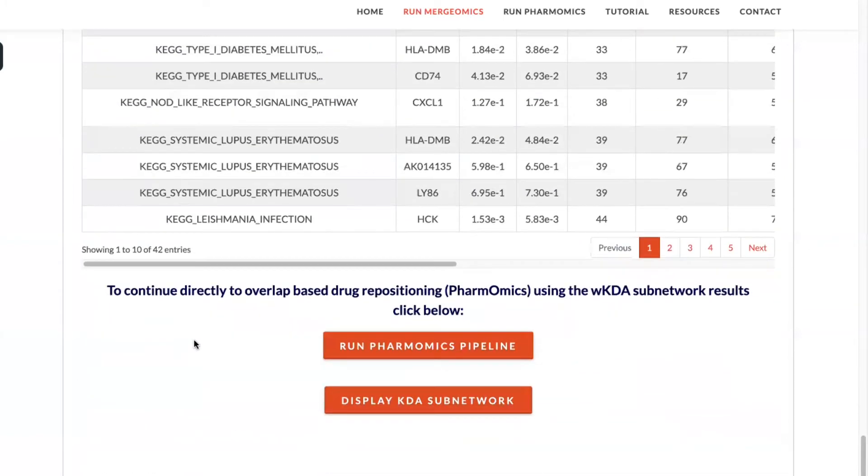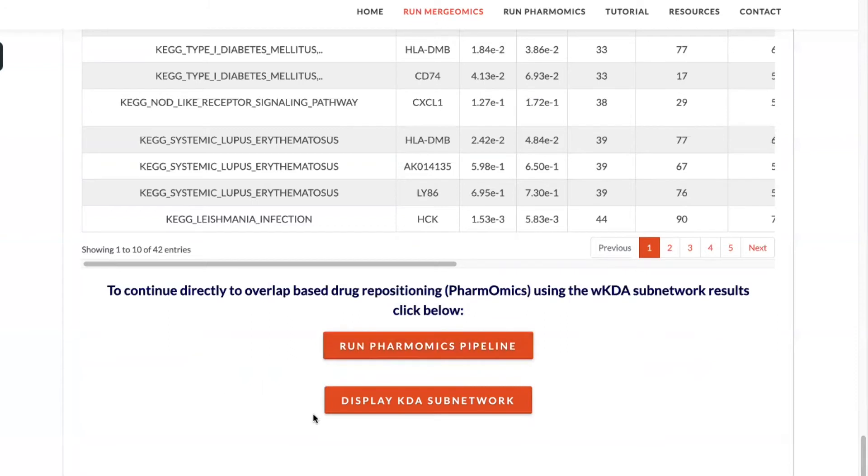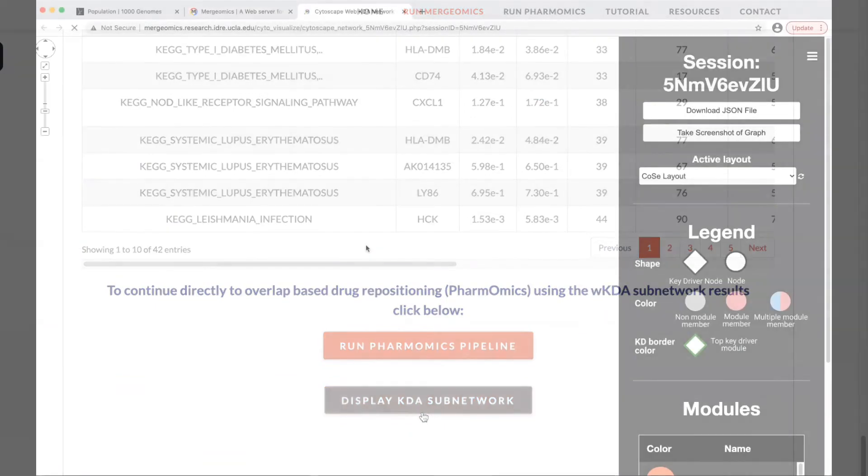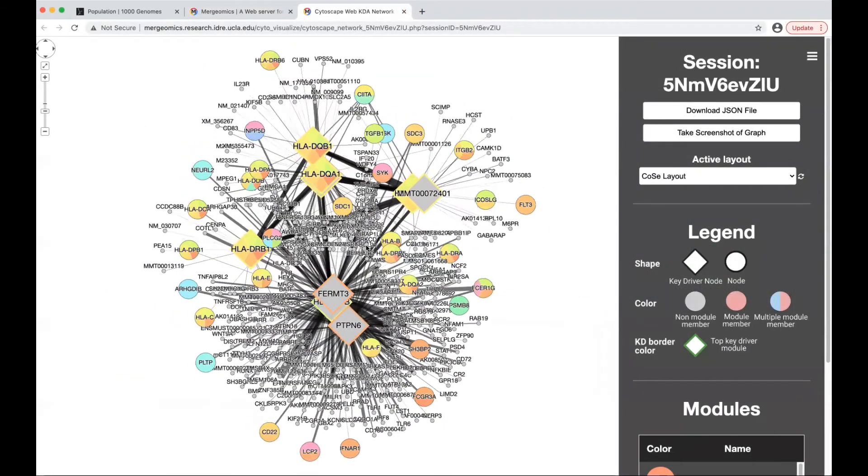You can also continue to the run pharma mix option for drug repositioning of these key driver results, or you can go and display your key driver network using our visualization tool. In this example, we will continue to display the key driver sub-network, where you'll be redirected to a new tab.